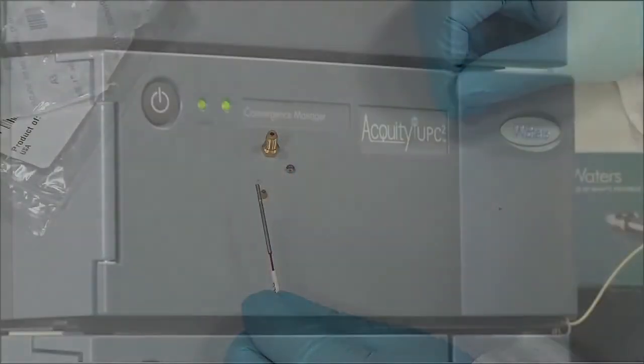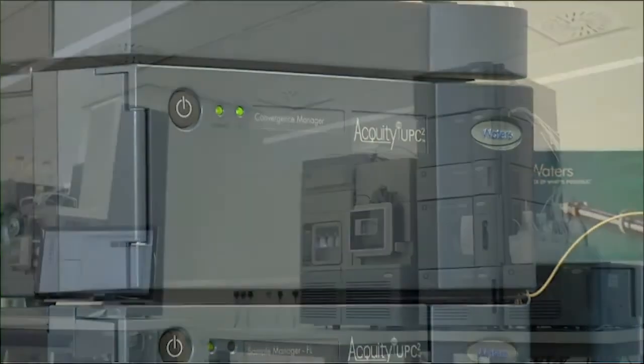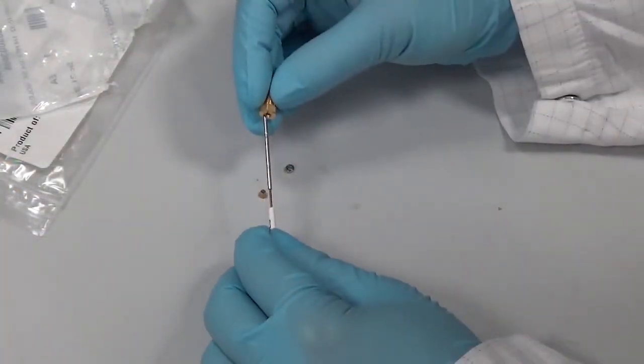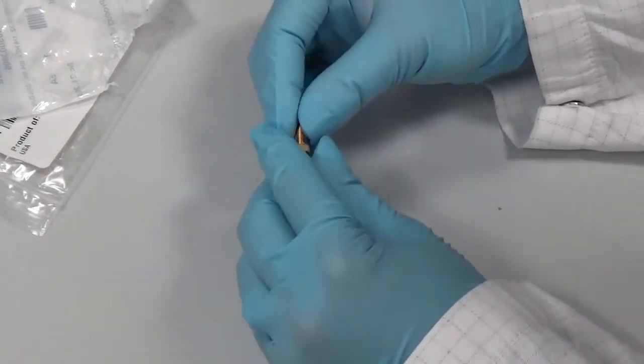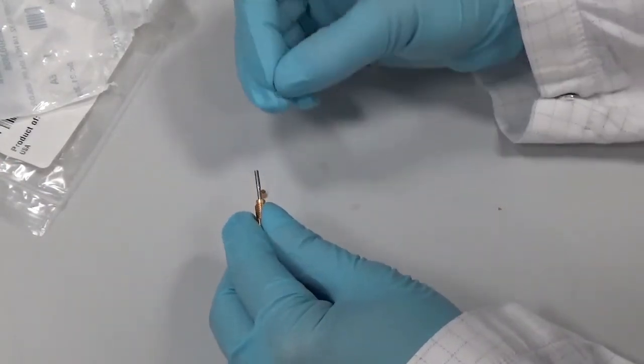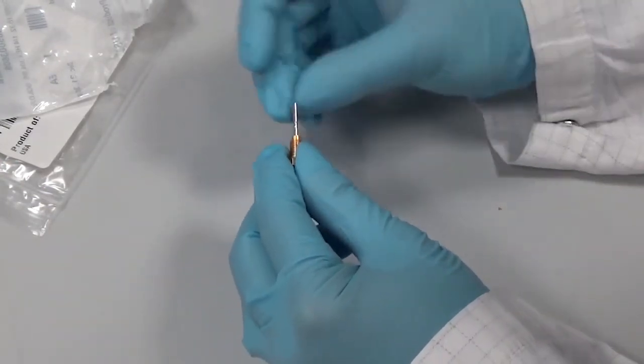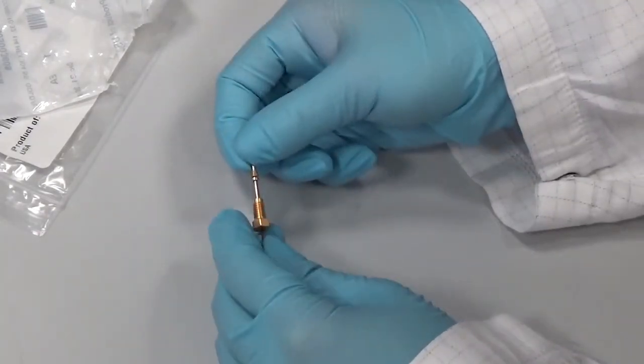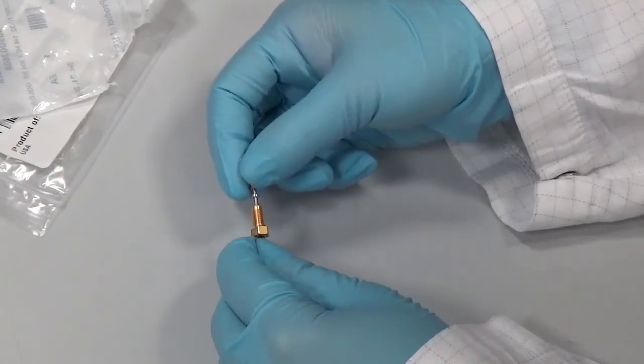To connect the probe assembly to a UPC squared system, fit the supplied UPC squared inlet fitting to the probe assembly by sliding the compression nut onto the probe assembly, followed by the backing ring and then the ferrule. The probe assembly is now ready to connect to the system.